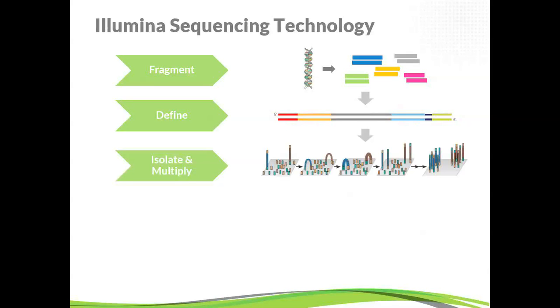So all next generation sequencing technologies are aimed at sequencing individual DNA fragments. But the sensitivity of the technology is not high enough to get enough sequence out of individual molecules. So for every unique fragment, we have to multiply that fragment. We have to make sort of a clonal population of each fragment in order to get a strong enough sequencing signal.